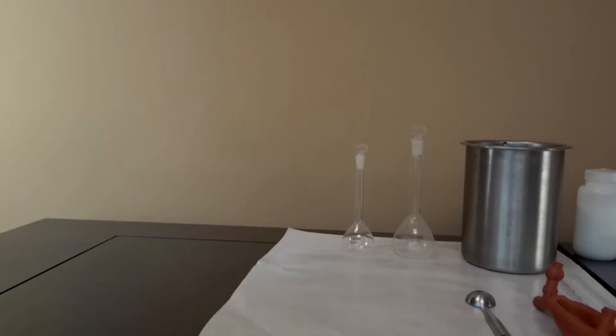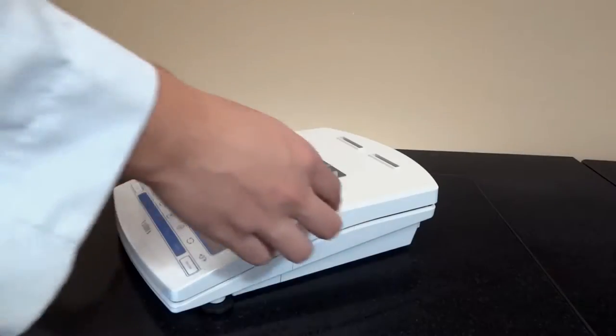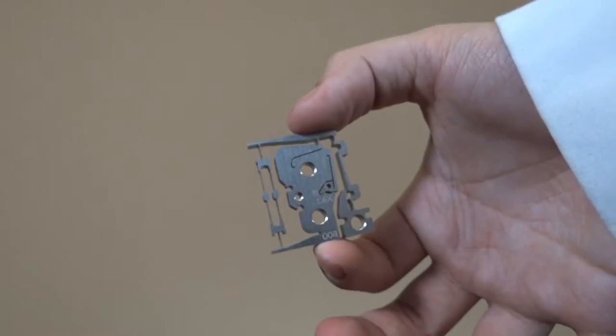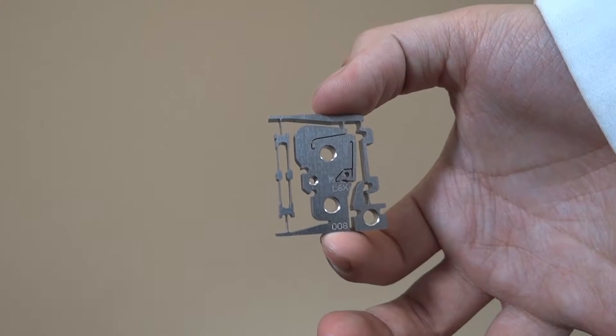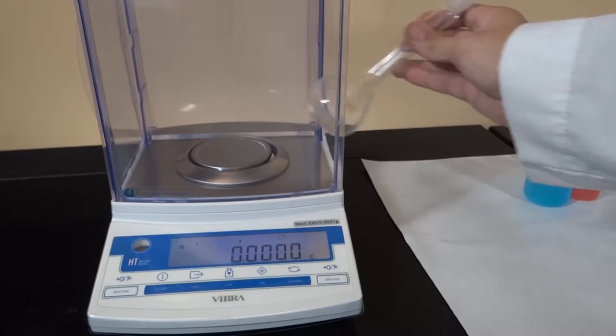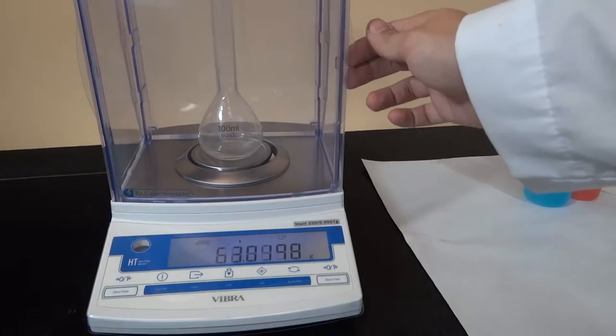The frame is exceptionally lightweight and sturdy, helping to protect the mechanism inside. Inside the HT is the Vibra Tuning Fork Sensor. Protected and sealed by a steel casing, the Tuning Fork Sensor has many advantages.